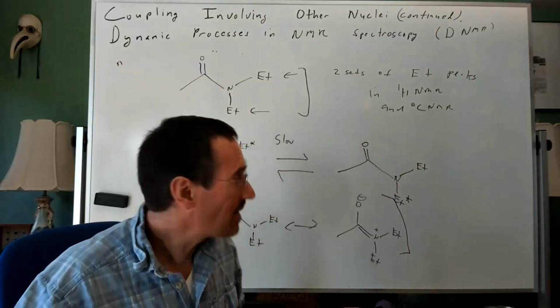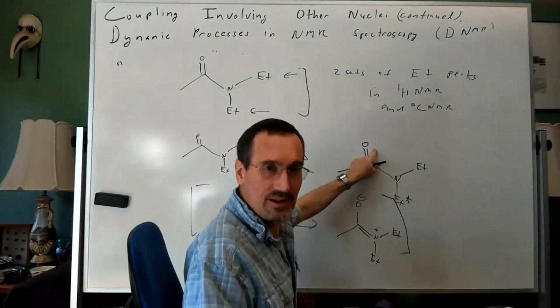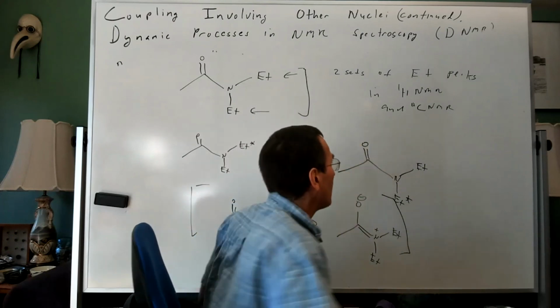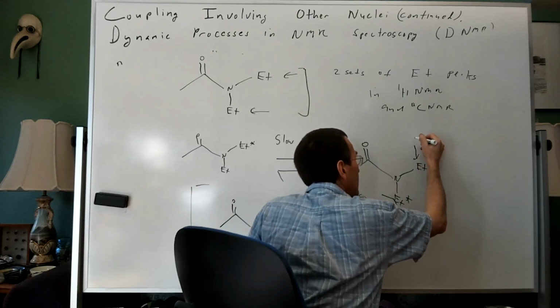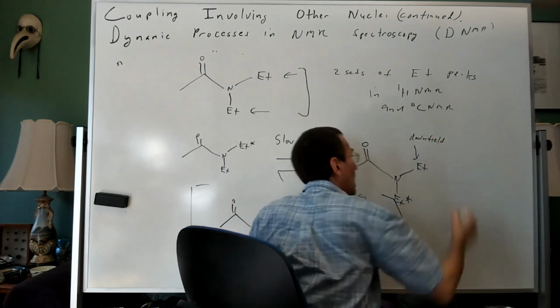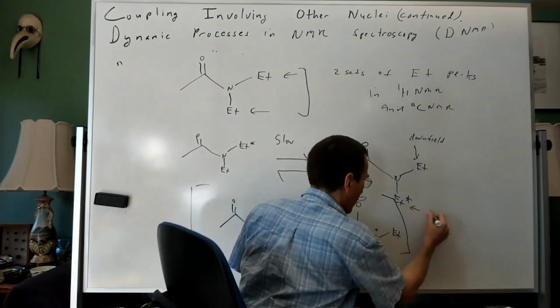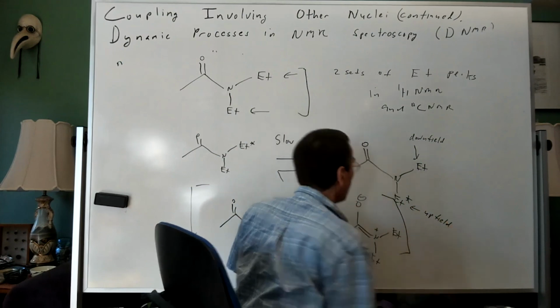methyl side? Great question. So in general, the carbonyl shifts groups downfield. The carbonyl has its own ring current. So I would typically expect this ethyl group to be slightly more downfield. In other words, higher chemical shift. And this ethyl group to be slightly more upfield.